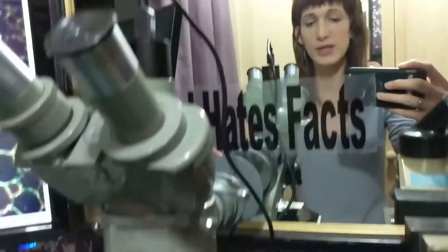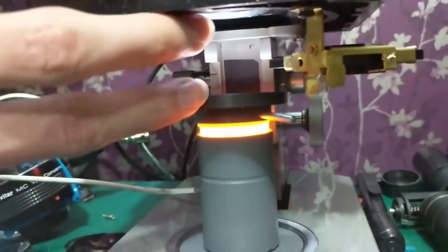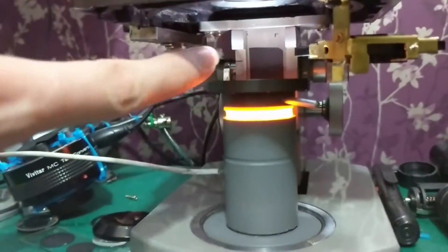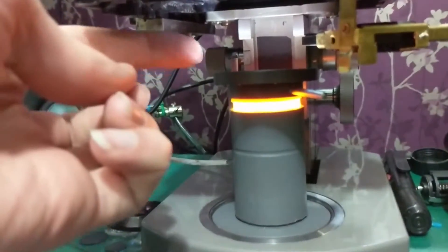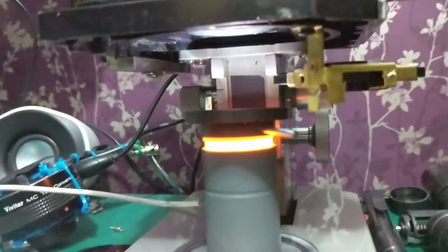I was looking around trying to find a Darkfield condenser that was inexpensive, and most of them are sort of £100 plus and work from underneath the unit. Your condenser unit is here and within that you've got an occultation disc, and then your light shines through it and you've got an iris on the bottom of it — that's how it's usually done.